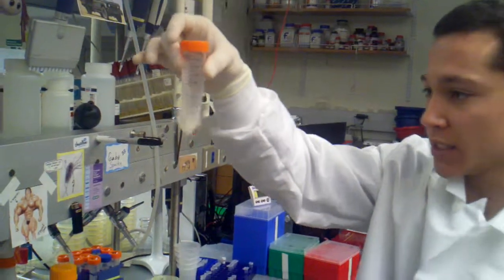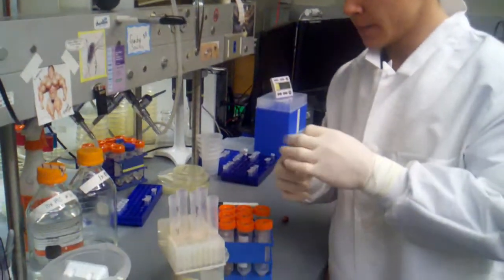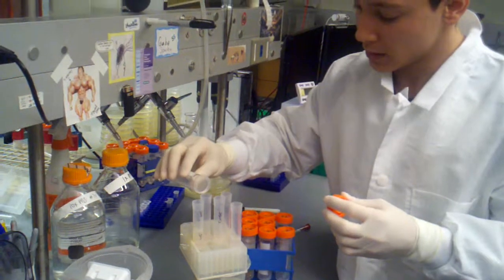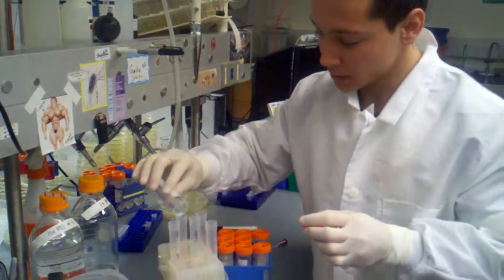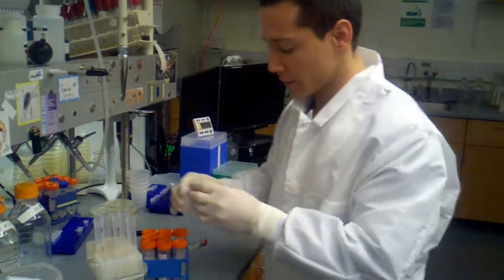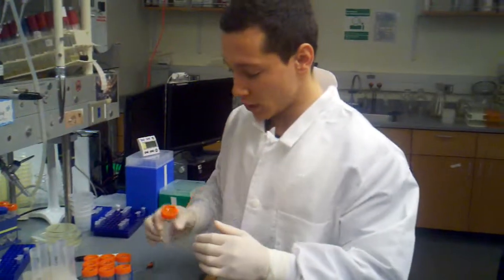I'm going to rinse these tubes out with PBS, and then we're going to be able to get the rest of our material. We're going to hold off and let these drain a little bit longer, and we'll come back in a quick second.